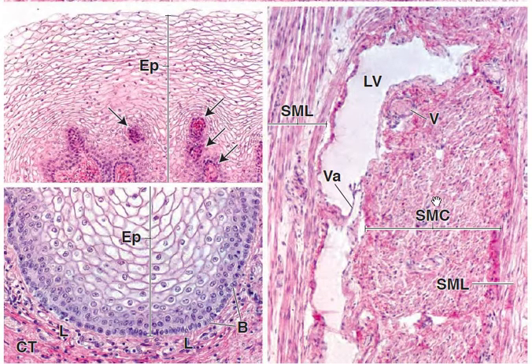This bundle abuts on a longitudinally sectioned lymphatic vessel. To the left of the lymphatic vessel is another longitudinal bundle of smooth muscle. A valve is seen in the lymphatic vessel, and a small vein is seen right here. Isn't that cute? Okay, that was all that fun stuff.